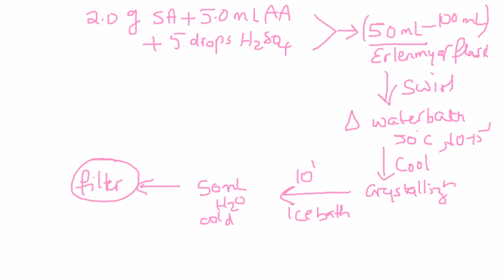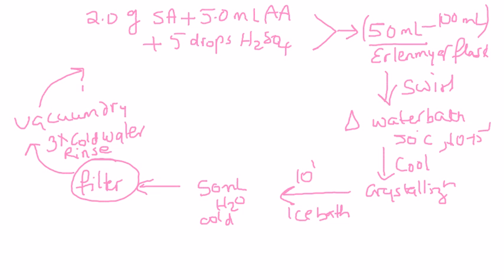And then you will filter. After we have filtered, we are going to rinse it a couple times, maybe 3 times, with cold water. Cold water rinse. And then vacuum dry.